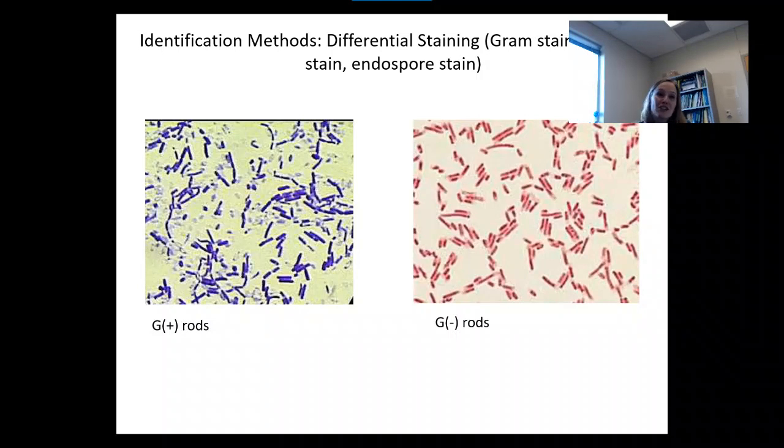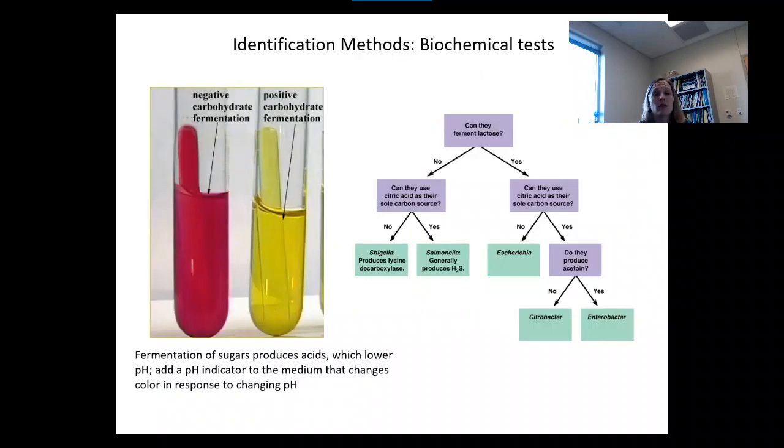Once you're finished with looking at it, the next step will look to see what chemical reactions the organism can do. And that will be really about 2/3 of the semester, spent learning the basic chemical tests that are commonly done to help you identify, because a lot of bacteria are gram-negative bacilli that have the same basic structures. So what do you do beyond what they look like? You have to start really digging in deeper, and that's what the biochemical tests will allow you to do.